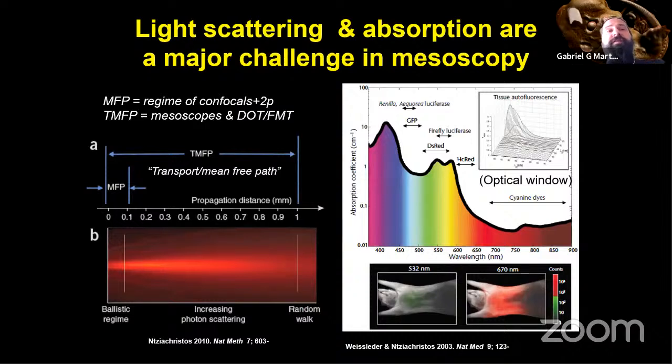I also want to talk about another important concept here, which is the mean free path, during which the photons can be expected to behave in what's called the ballistic regime. In other words, if you're firing a laser and you expect photons to travel on a linear path, don't forget that light has both particle and wave nature. So think of it now as a particle. If you're firing laser light through your objective, it will go in as a straight ray. But as soon as it enters biological material and starts colliding with sugars, lipids, water, and even gases mixed in with the liquids, it starts bending.